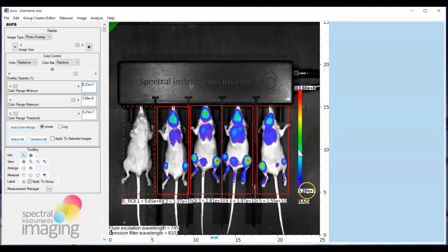And what you'll get now is the threshold value of data presented as the minimum of your calibration bar, and you also already have the maximum in the calibration bar, capturing the entire dynamic range of the image presented in your Amy file.